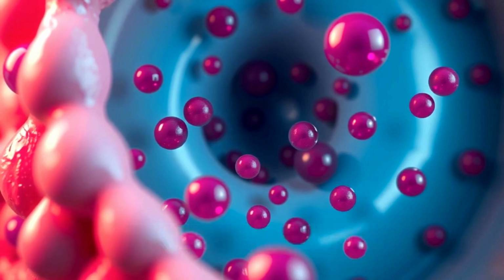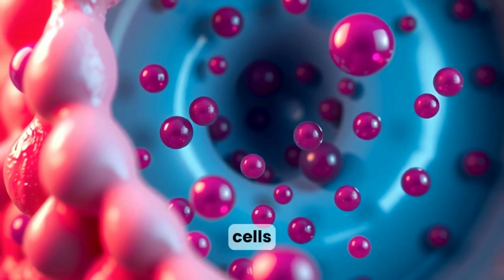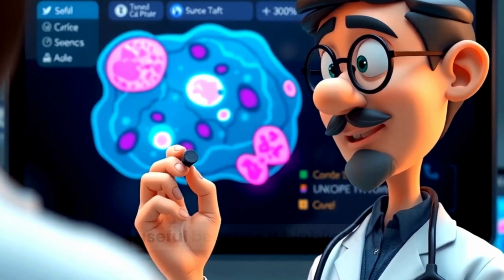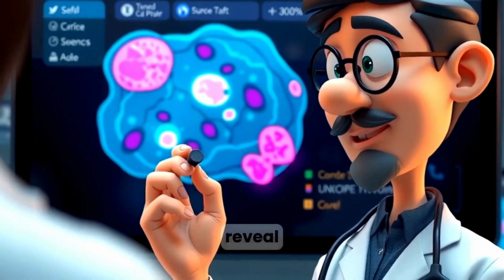Commonly observed targets include glycosaminoglycans in cartilage and granules in mast cells. The effect is clinically useful because it highlights specific tissue chemistry that ordinary staining might not reveal.